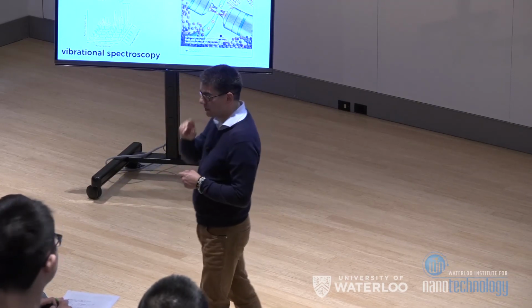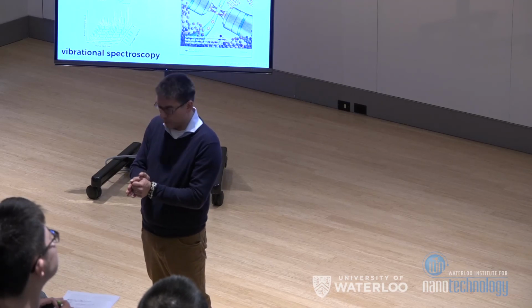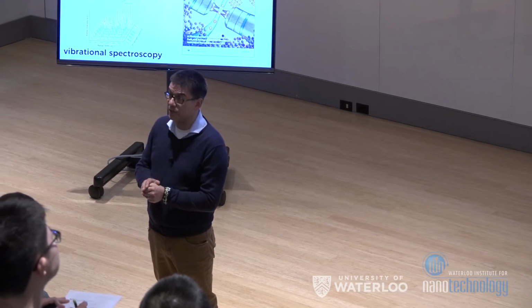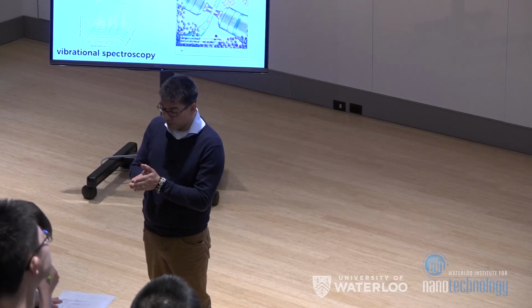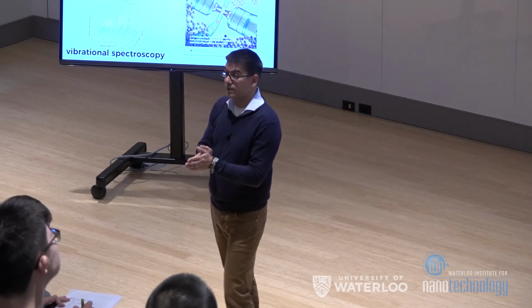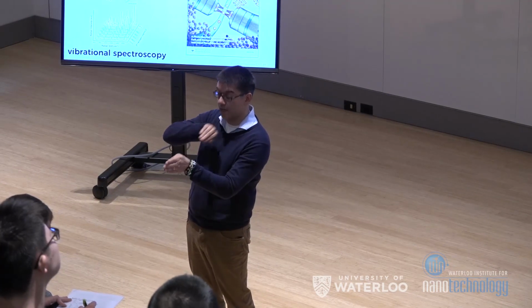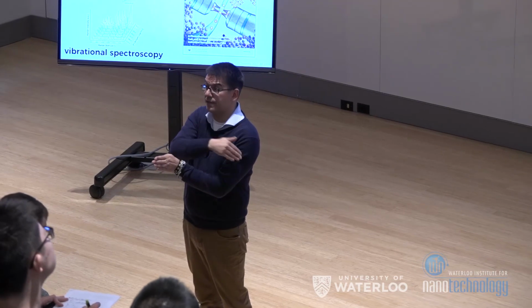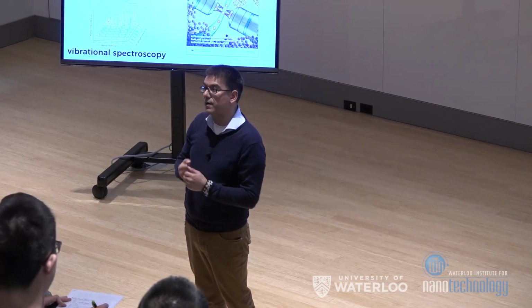Initiating the reaction is very, very simple, but terminating the reaction is clearly important for nanomaterials as well, because you either want to terminate the growth or stop aggregation. But you can use a microfluidic approach to do that as well. Jensen's group at MIT have shown very elegantly how you can use little capillary splitters where you take the segmented flow and you can direct the continuous phase one way, take the product another way, and you can recycle it. So that's very easy to do.